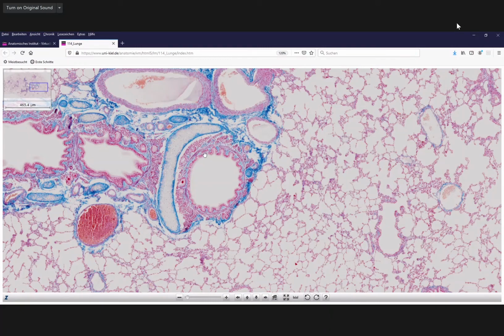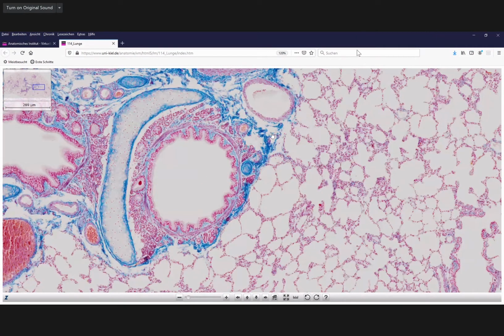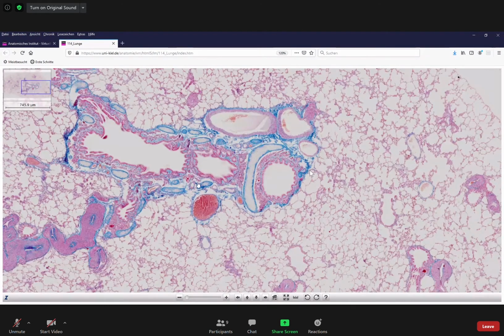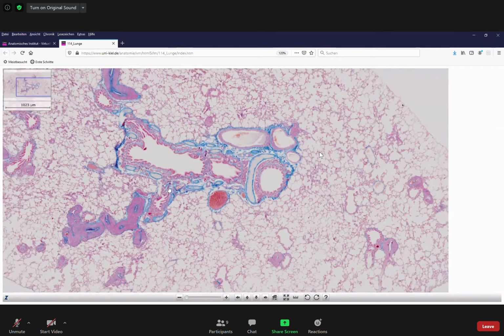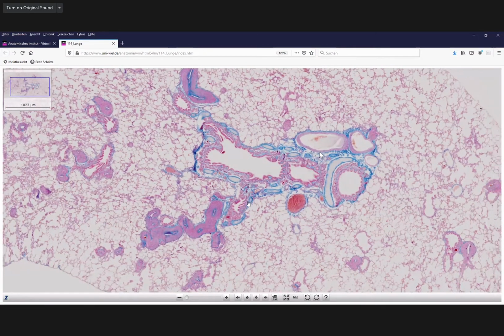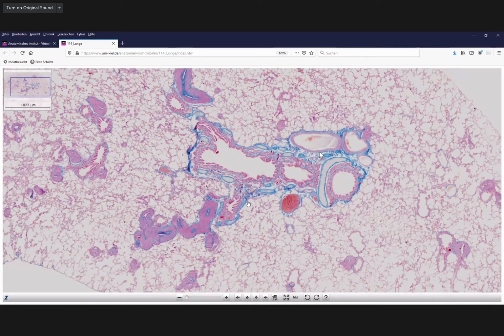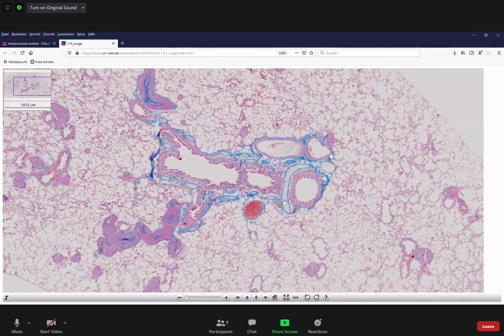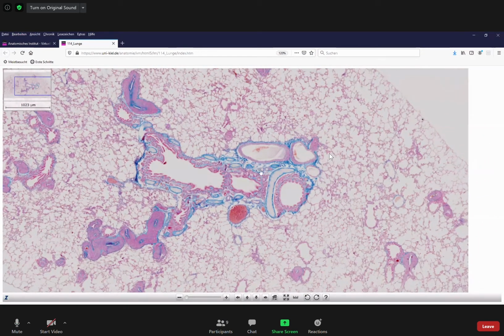and cartilage, you call this a bronchus. From there, what is the next part of the bronchial tree, the next name? Bronchiole. The bronchiole. And what is typical for a bronchiole? What do you remember? It had a different epithelium. Yes, in which way? No cartilage anymore, exactly. So it loses cartilage.